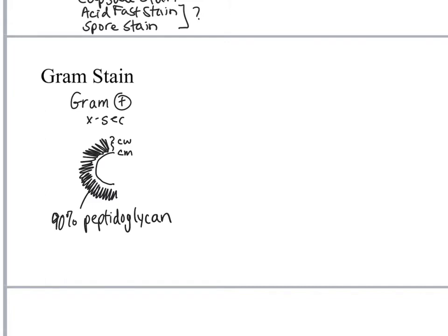And what is peptidoglycan? Well, when you see this portion of the word, peptid, that should make you think peptide. There are some amino acid cross bridges in that compound. Glycan, that part of the word should make you think sugar. So there's a couple of different alternating sugars, very similar in structure to glucose, and they're cross-linked with these amino acid bridges. So it's a very rigid structure, and gram-positive cells have a whole lot of it, and that really makes them hold on to dyes for a lot longer instead of being very easily decolorized.